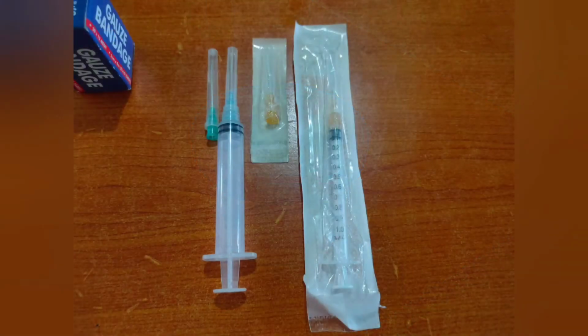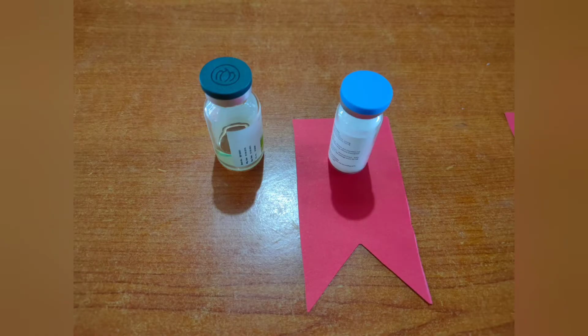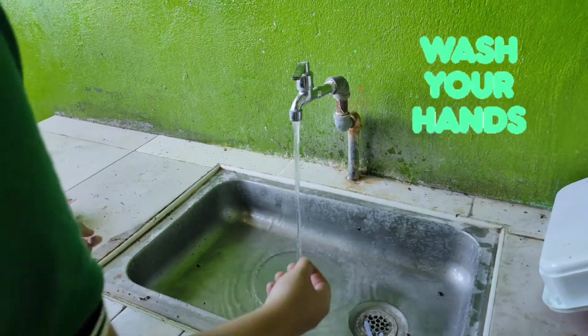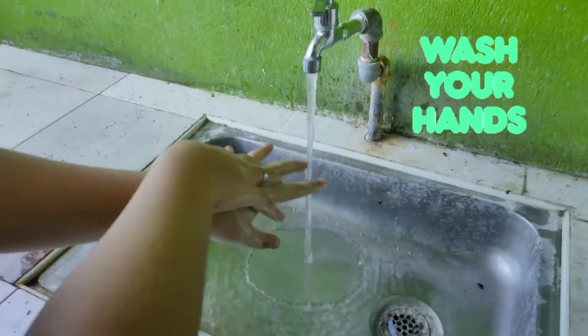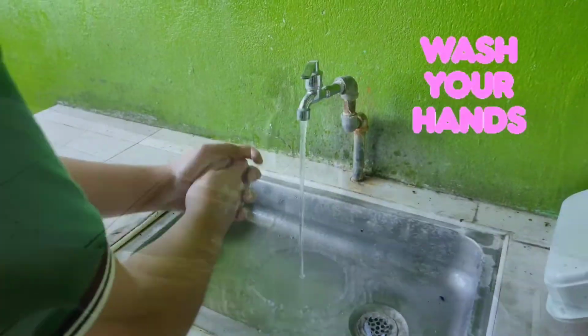Gather the materials like the cotton swab, the syringes, and the vial. Next is to wash your hands to avoid contamination. And afterwards, you put on the gloves.